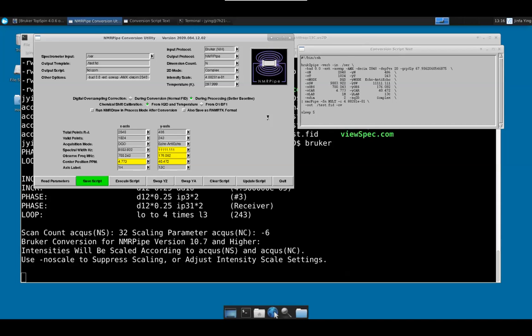It will be saved. Now, one thing unfortunately is that our own sequence, Frank's tool is really optimized for Bruker standard sequences. For our own, it doesn't really read some information correctly. For example, this thing, actually this might be right. Yeah, this is right. It's carbon frequency, and it's 1/2 IN0. It's a spectral width, and it is echo, anti-echo, and these are right actually. You can always save that, but don't save it because I already have it for you. Okay, just in case that it's a new data set.